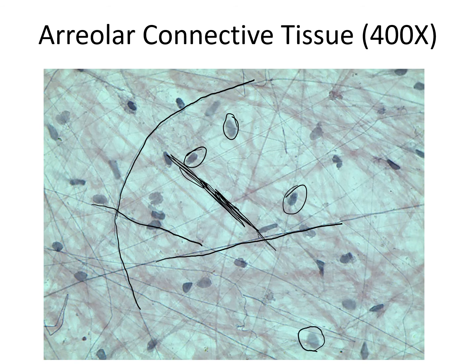And we do have reticular fibers. We cannot see them on this photograph, but it's pretty loose. You see lots of fibers, some cells here and there. So that's how areolar connective tissue looks like.